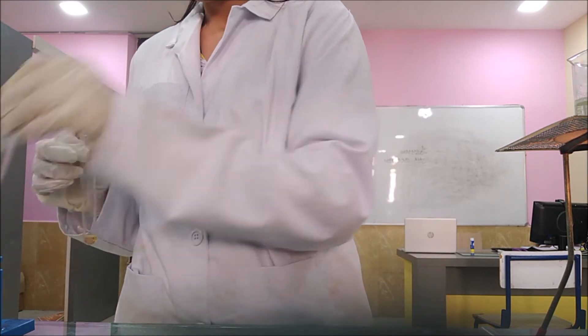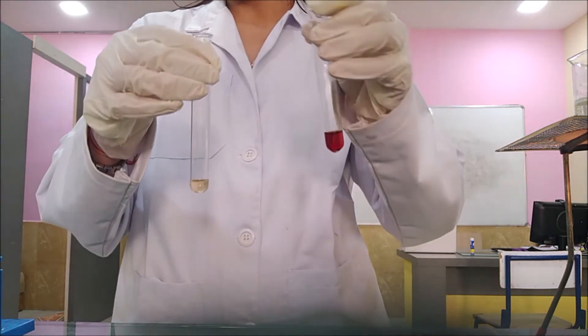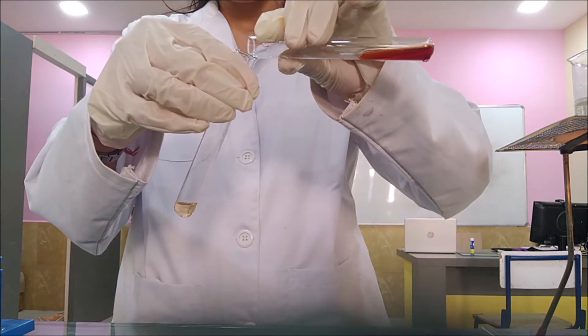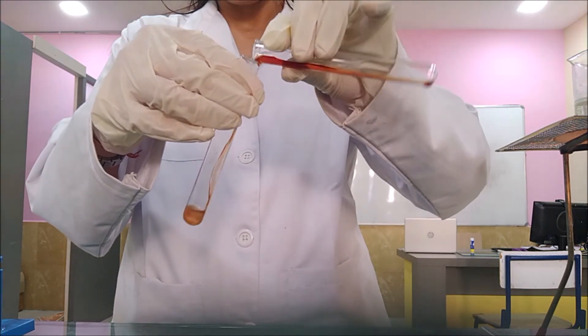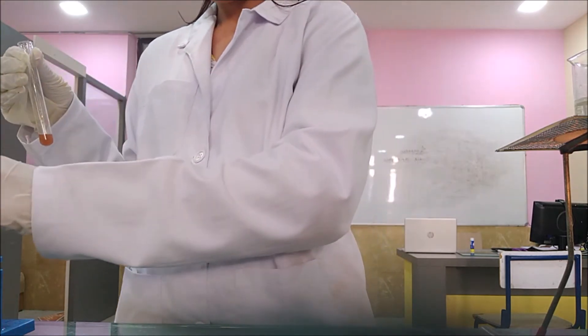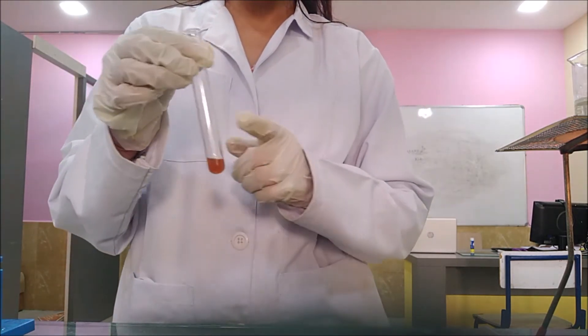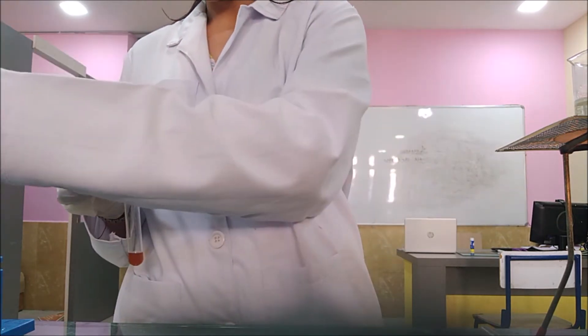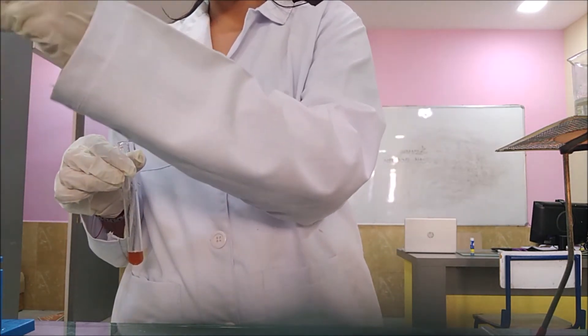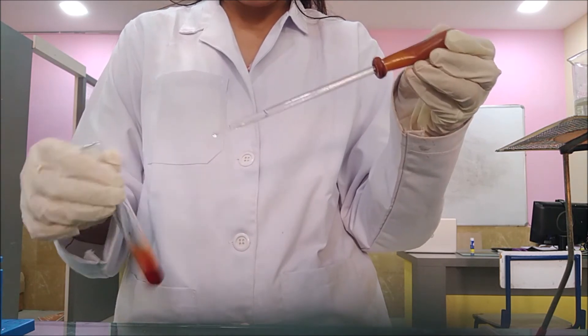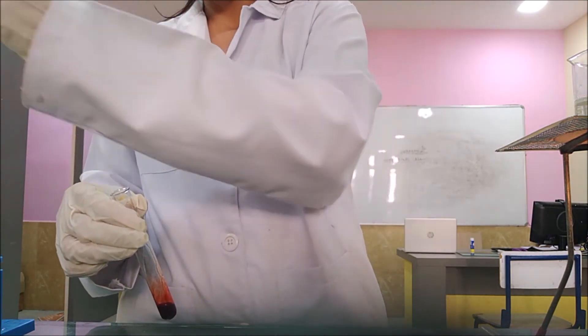Now add around 2-3 drops of Sodium Nitroprusside in your organic compound. Shake it well. Now add around 1-2 drops of NaOH. Shake it well.